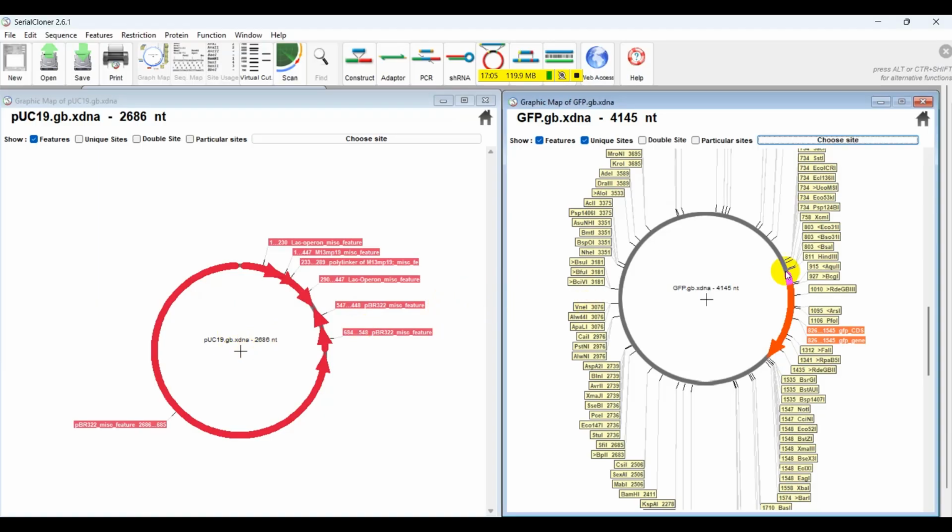So how can we do that? So let's see what can I do now.